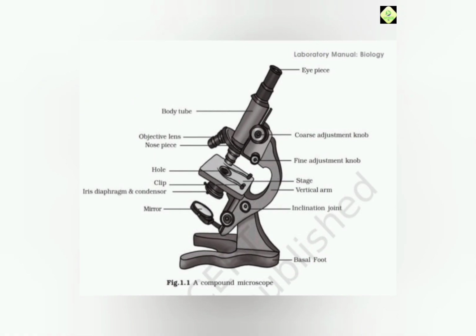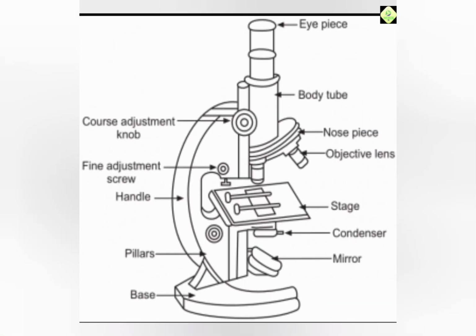Second, electron microscopy, which includes TEM and SEM. Third, scanning probe microscopy. Fourth, X-ray microscopy.